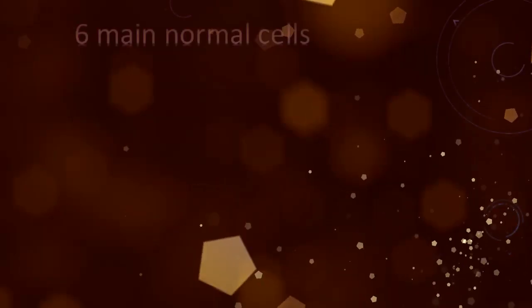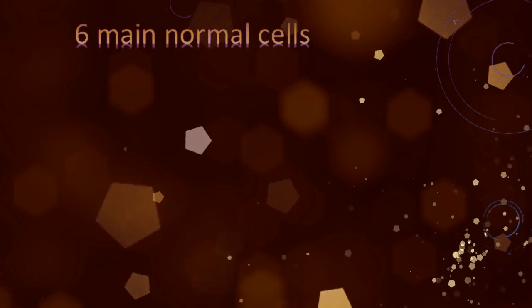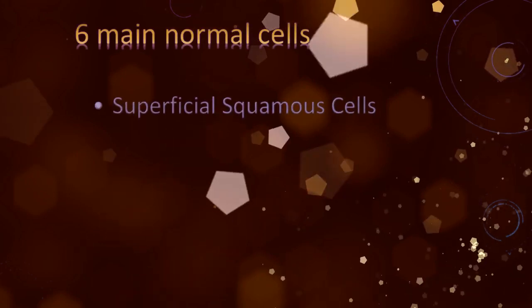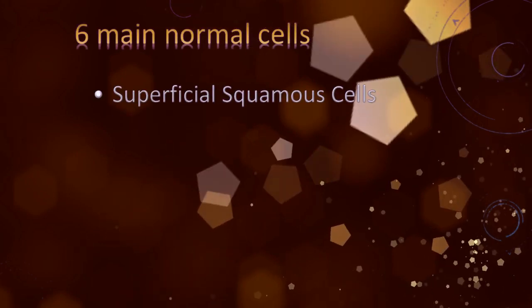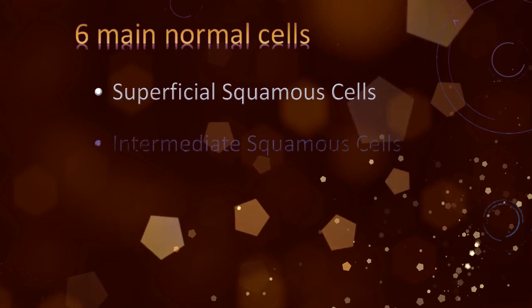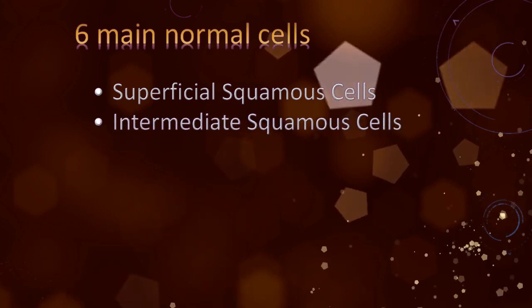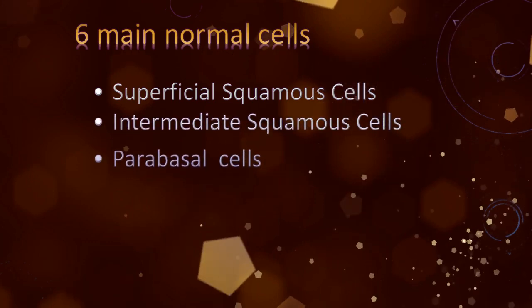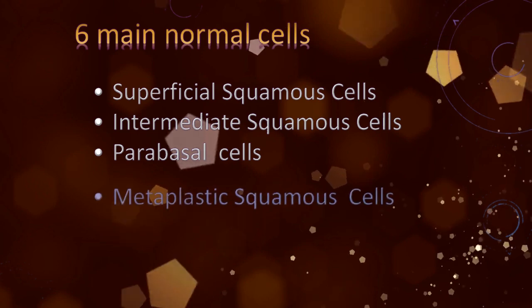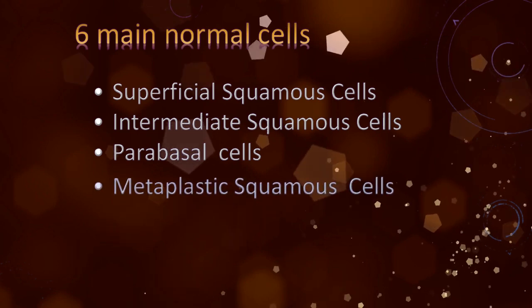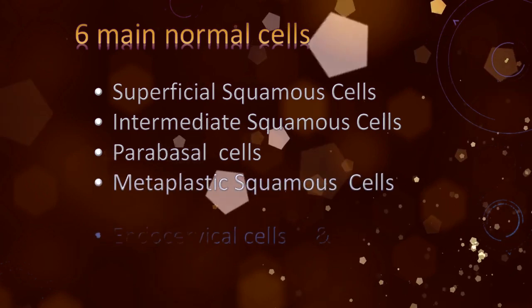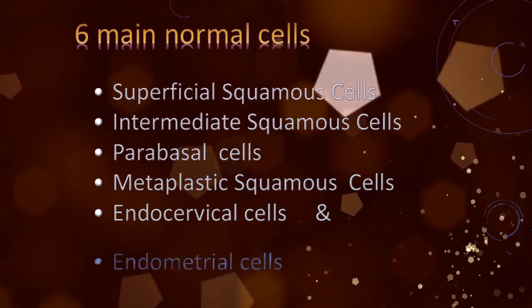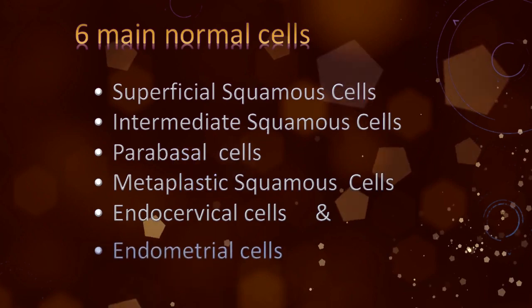There are 6 main normal cells we can see in a cervical smear: Superficial Squamous Cells, Intermediate Squamous Cells, Parabasal Cells, Metaplastic Squamous Cells, Endocervical Cells, and Endometrial Cells.